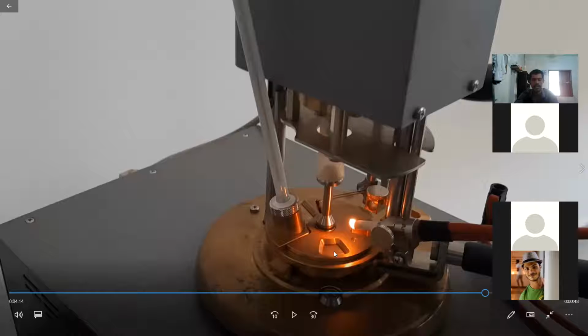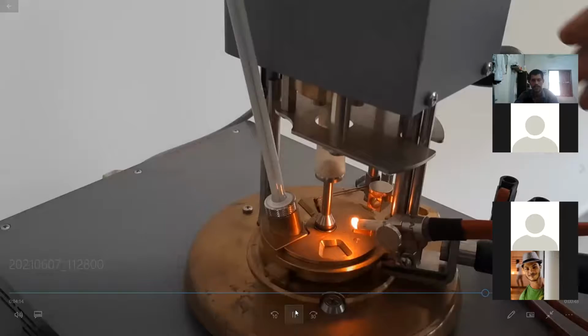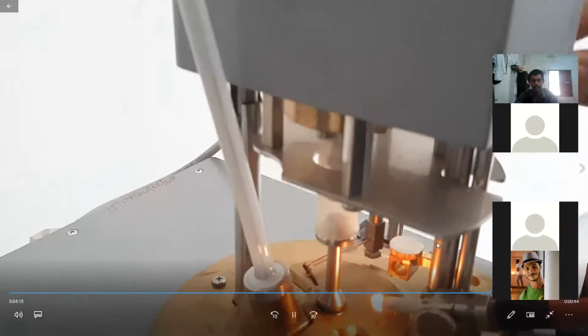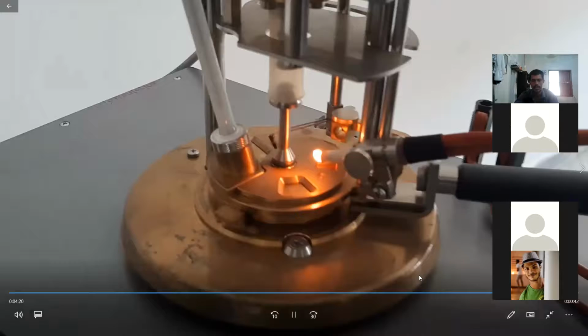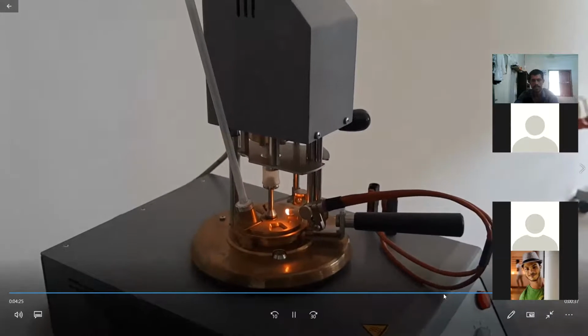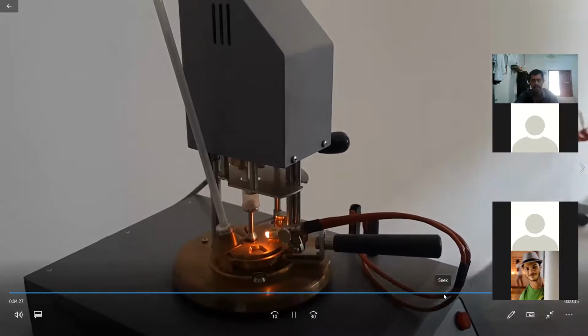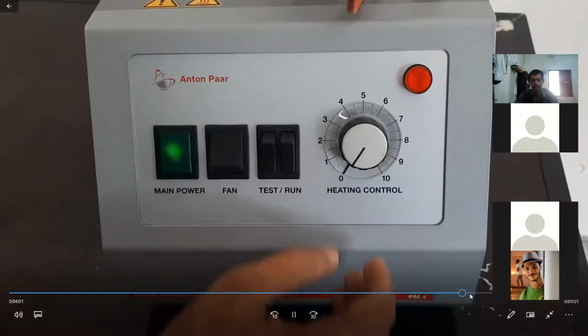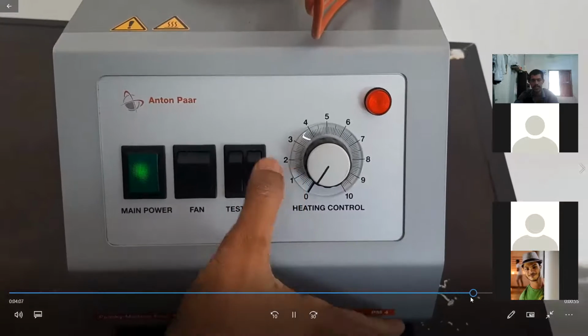There will be fuel vapor and air, and we are going to introduce the fire inside this cup. You can see this is burning, right? That means it is higher than the flash point. So that is already heated here. Check.